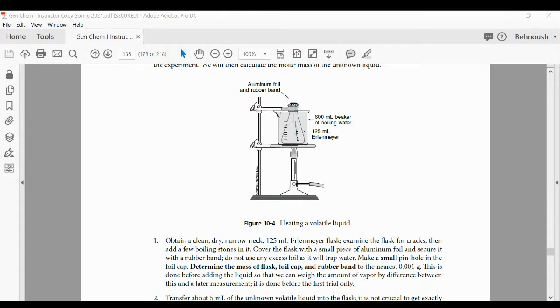You can fill up the flask all the way and then transfer into the graduated cylinder, or you start with a 200 milliliter flask filled up with water to the mark of 200 and pour into the flask and see how much water it takes to fill up the flask and how much is left in the graduated cylinder. Let's say if only 30 milliliters is left, then we know 170 has been consumed to fill up the flask.